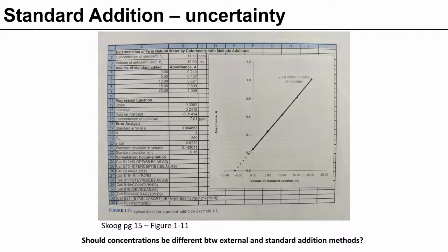That's one of the big advantages of standard addition, that it's automatically accounting for any differences due to matrix interferences, because you have that sample matrix in every one of your calibration solutions. So standard addition, if you've got a really tricky matrix, is oftentimes the gold standard for producing the most accurate, reliable results.